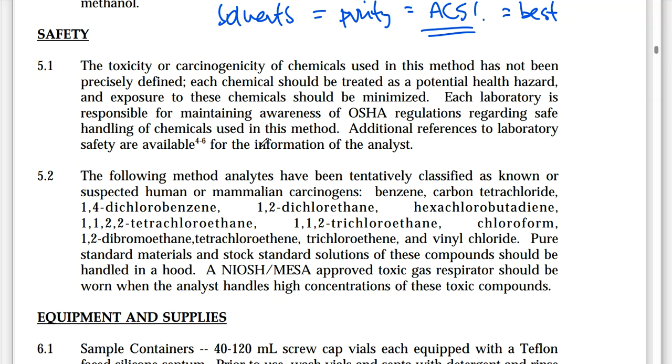As you can imagine, if this is my first time doing the method, I would have no clue what I'm doing. Oh my God, I'm going to blow myself up. So safety will give me this idea of how to handle myself and how to handle the reagents and what I need to do on my end to make sure that nothing is going to happen to a person as they perform this method. So it's a very good resource for you to use if this is your very first time doing the method. And this is also going to be built in to the proper SOP, just like interferences will be. They will be built into the SOP if we can prevent those from happening.